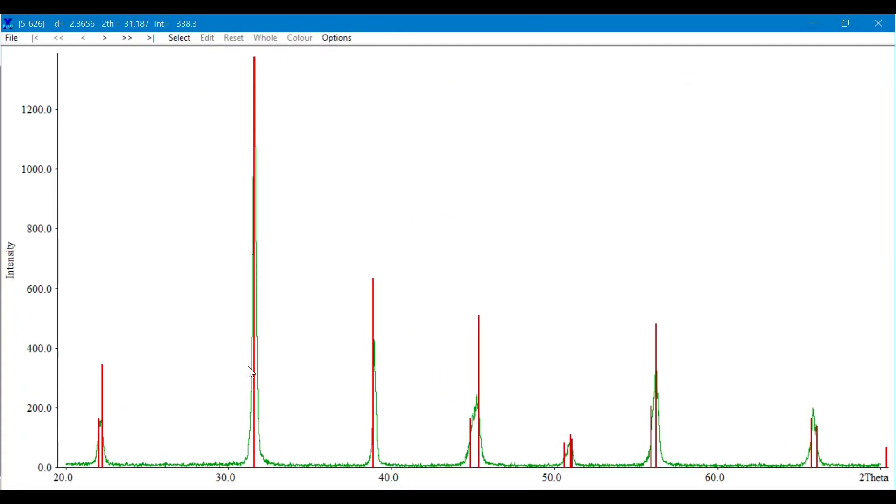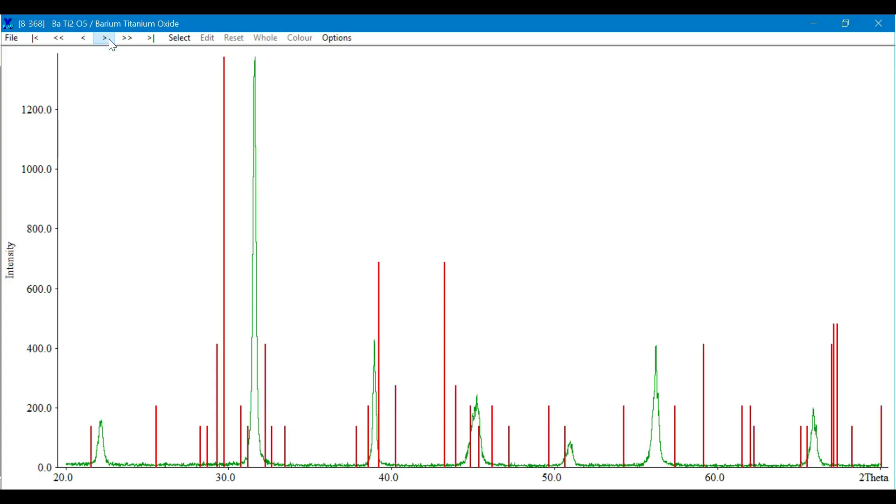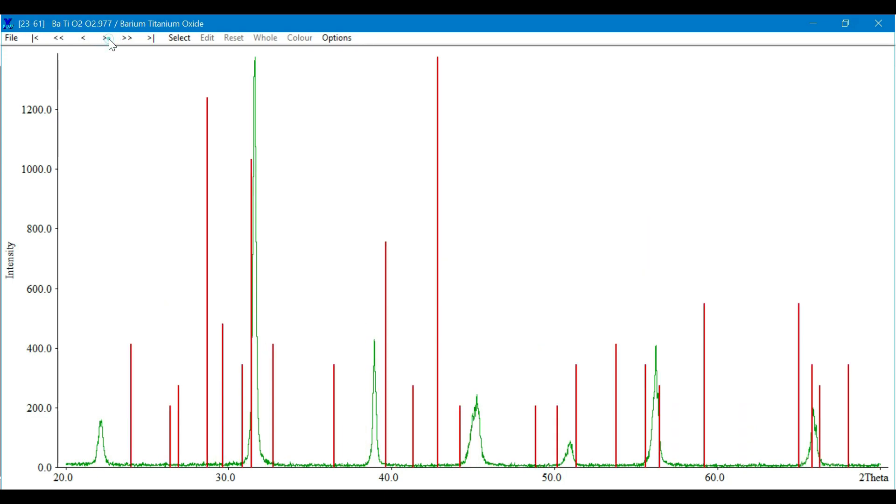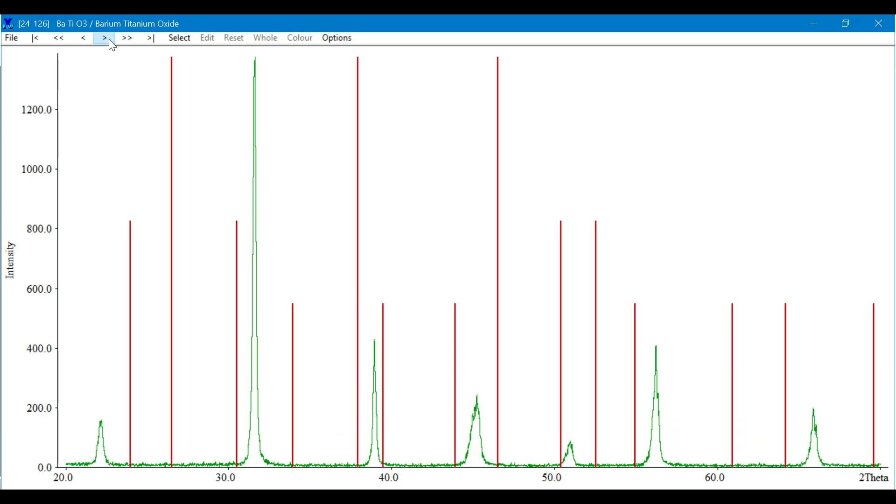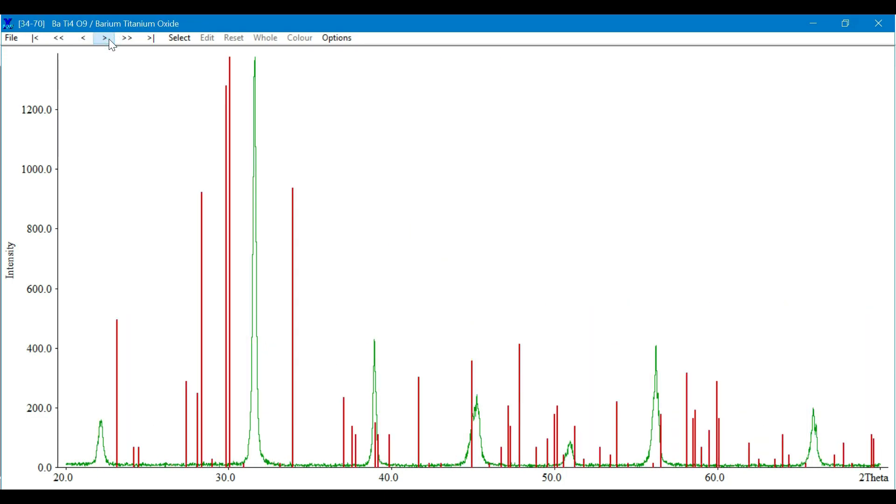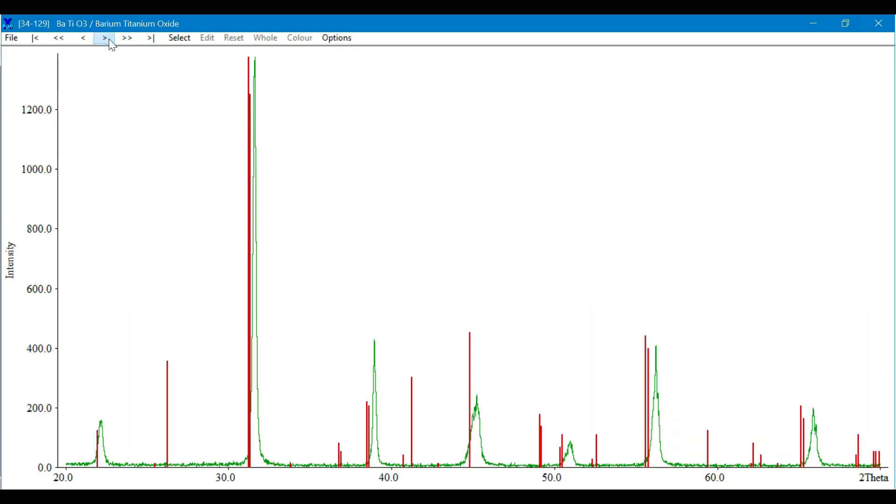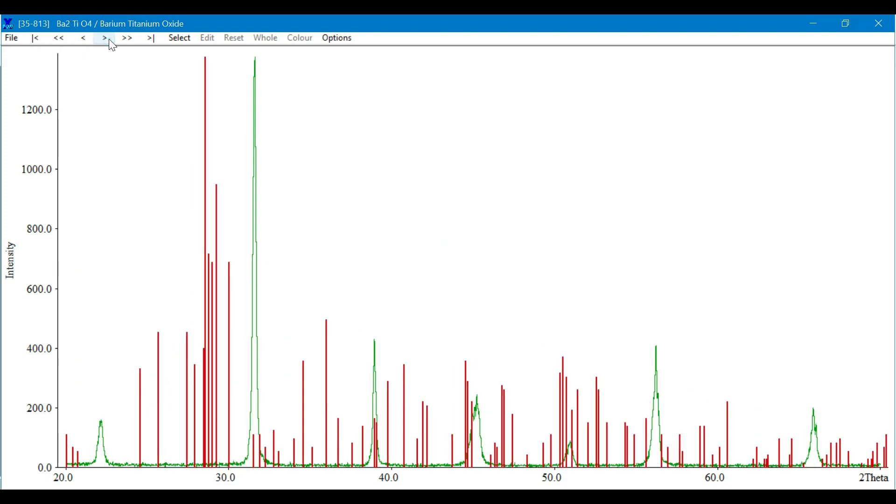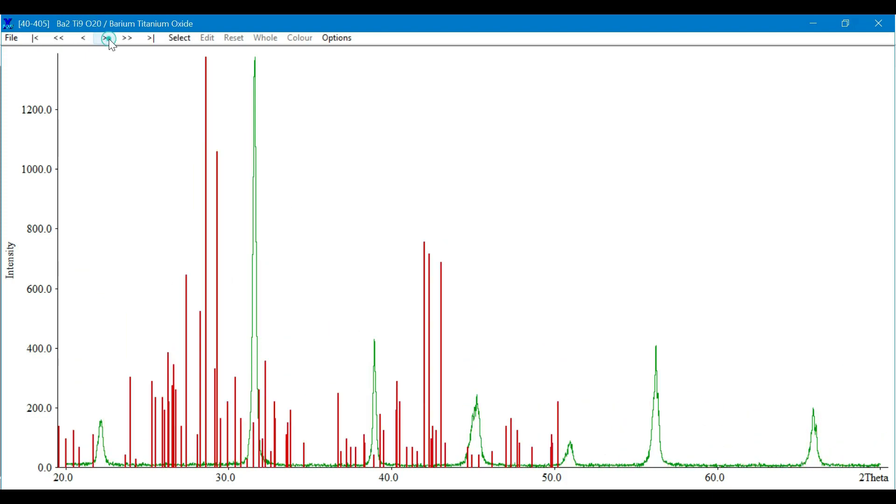There are some other cards as well which do not belong to your sample, so you may skip it, but you can note the PDF card number.